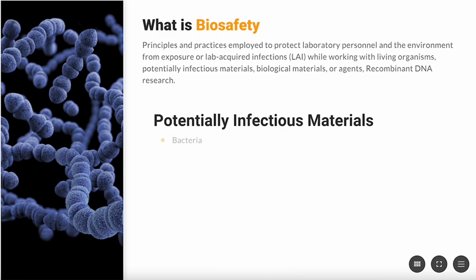Biosafety is the set of principles and practices used to protect laboratory personnel, the public and environment from exposure to or lab-acquired infections, LAI, while working with potentially infectious materials such as bacteria, viruses, fungi, human blood, unfixed tissue, human cell lines, and recombinant DNA. It includes the implementation of guidelines, policies, and procedures that help to prevent the accidental release of these materials and to minimize the potential for exposure.